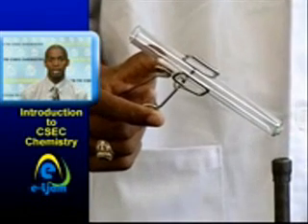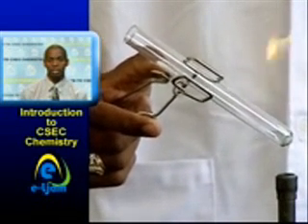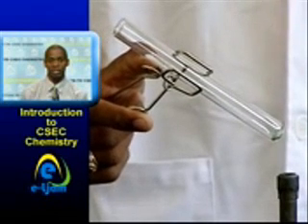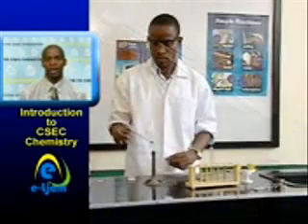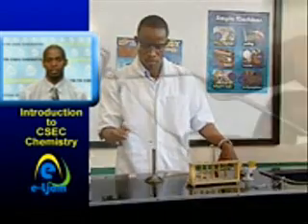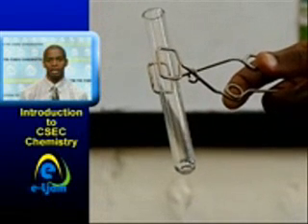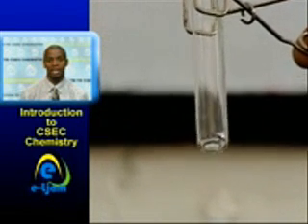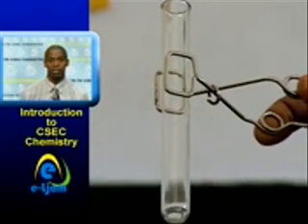The test tube is placed in the holder in a vertical manner, and when substances are added to the test tube, the holder is articulated in a fashion where the mouth of the test tube is held away from the experimenter or anybody around the experimenter. Ensure that the test tube holder is working properly in that it can hold the test tube and its content, and to prevent the test tube from falling and causing accidents.